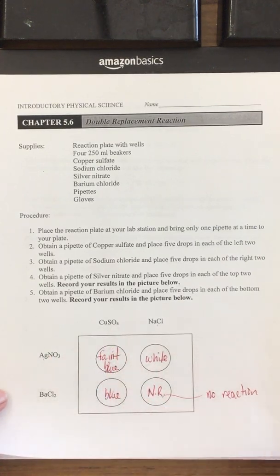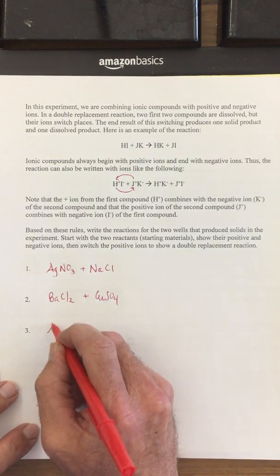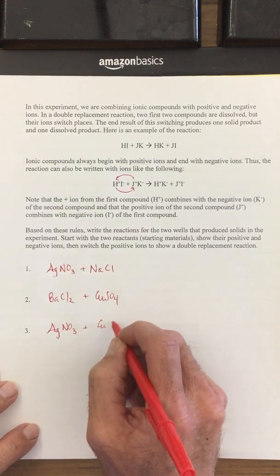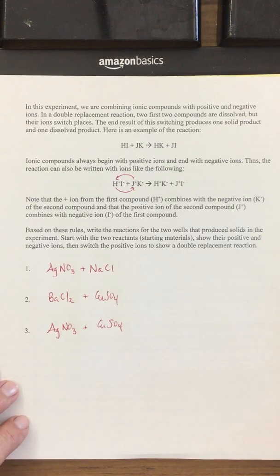That's going to be one of the hardest ones to combine. So we have the AgNO3 plus the CuSO4.